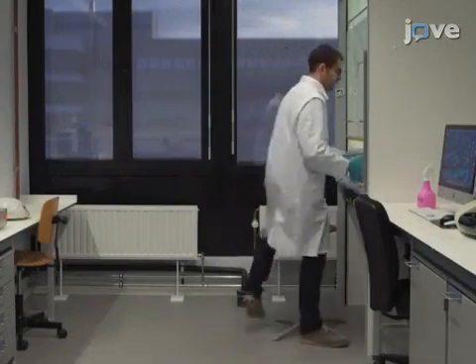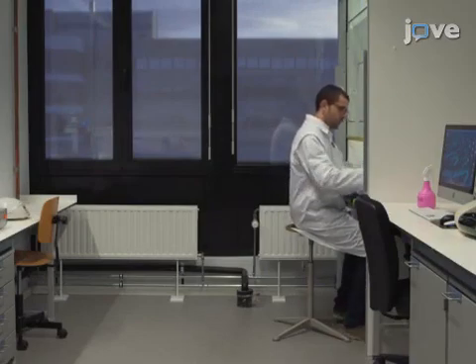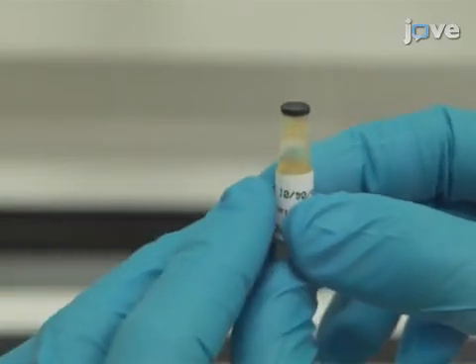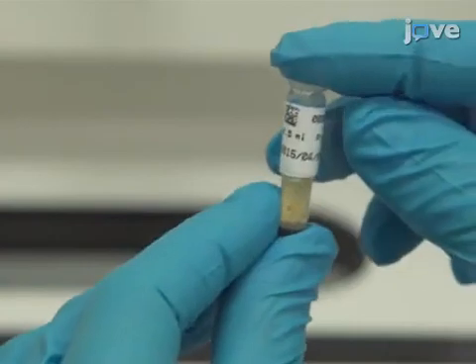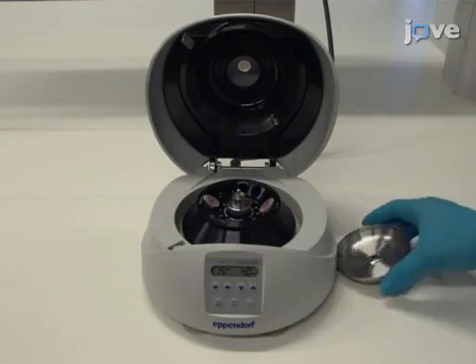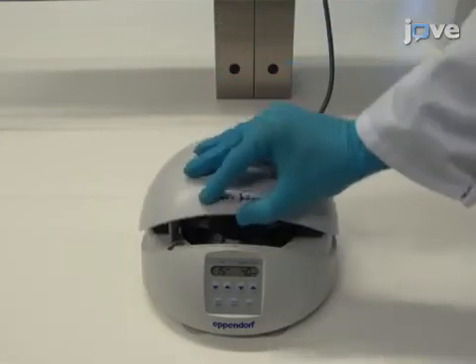To begin, thaw a 1-milliliter plasma sample on ice. Once thawed, invert the tube several times to disaggregate any cryoprecipitants that may have formed. Then centrifuge the plasma at 2,000 g for 20 minutes at room temperature in order to remove cells and debris.